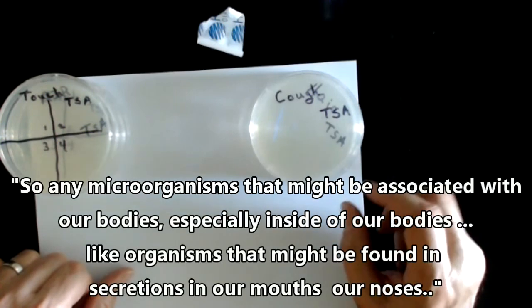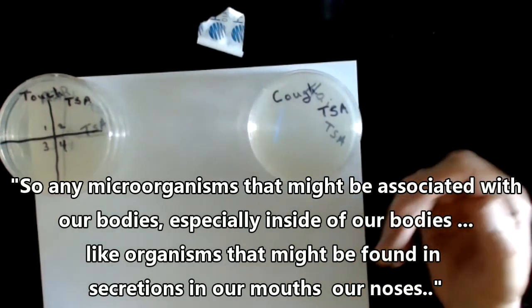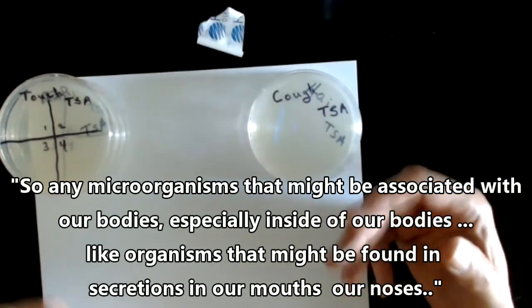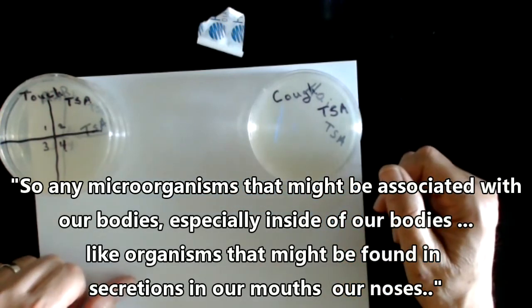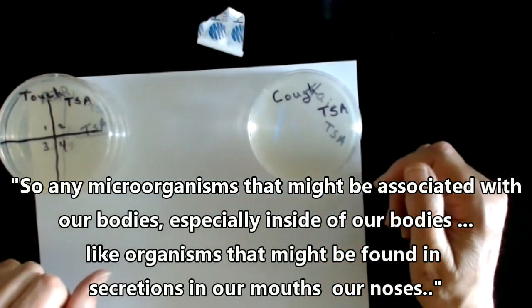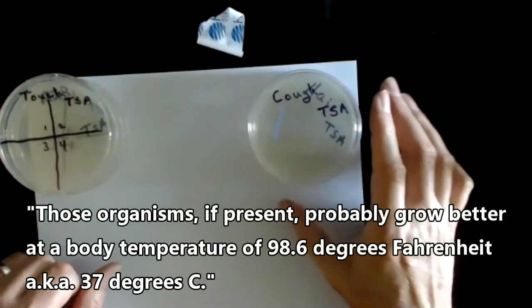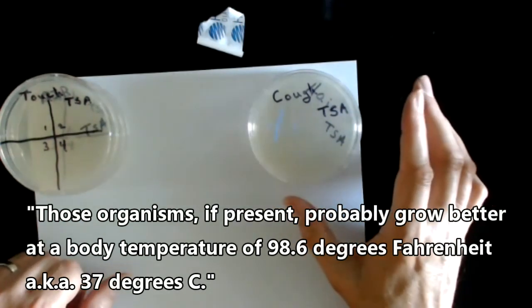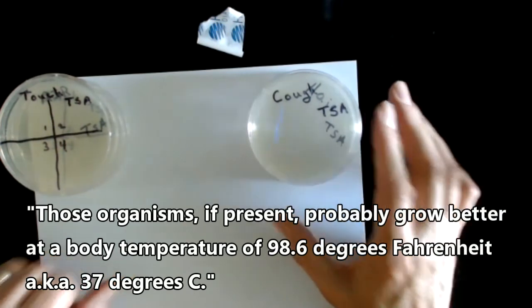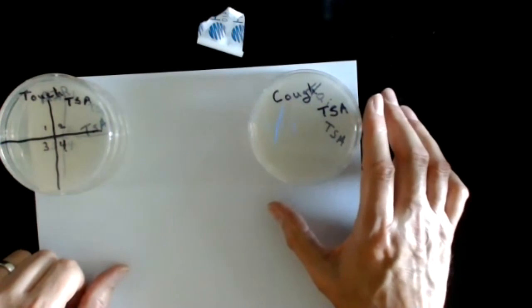So any organisms that might be associated with our bodies, certainly the inside of our bodies, like microorganisms that might be found in our secretions in our mouths and noses, or the organisms that might be found at the bottom of a hair in the hair follicle, if they're present, probably grow better at body temperature, 98.6 degrees Fahrenheit or 37 degrees C, than they would in a drawer at room temperature.